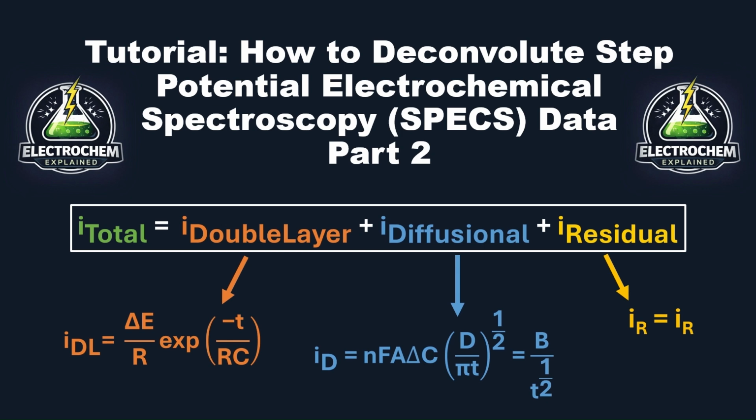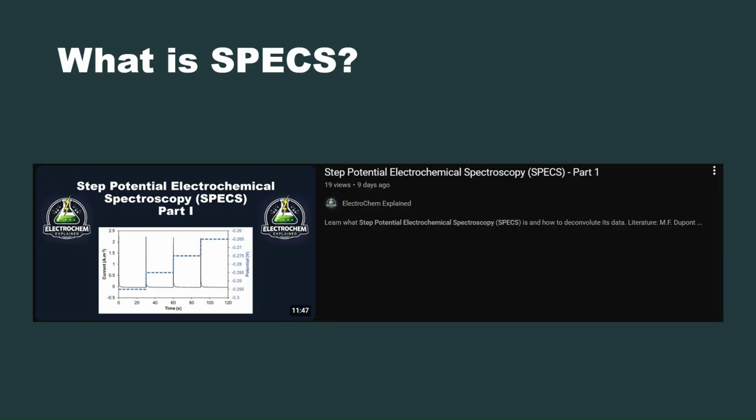Hello, so this video will be a tutorial on how to deconvolute SPECS data. If you haven't watched my previous video already on what SPECS is and the logic behind it, please feel free to go watch that and hopefully you'll be able to follow along with this video quite easily.